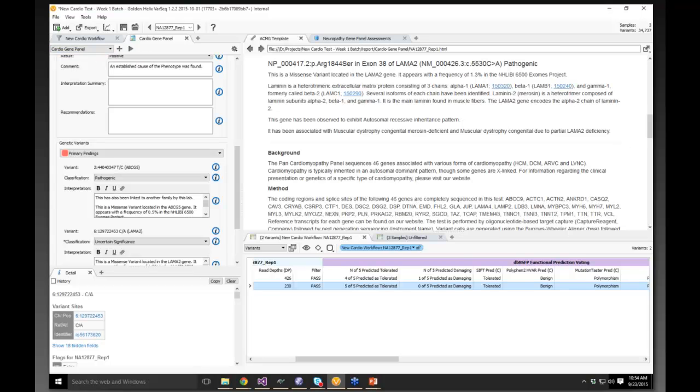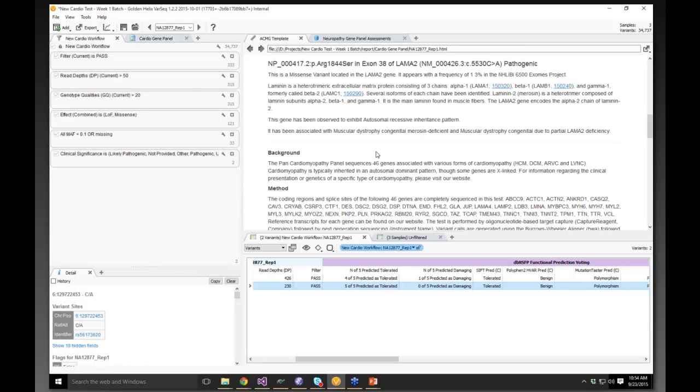Are the reports charged per sign-out or on a yearly license? Well, that's a very good question. Everything in VarSeq is not based on a per sample or sign-out basis. It is a subscription model, so you can use this. It's really your business. We don't want to try to involve ourselves on a per click basis.